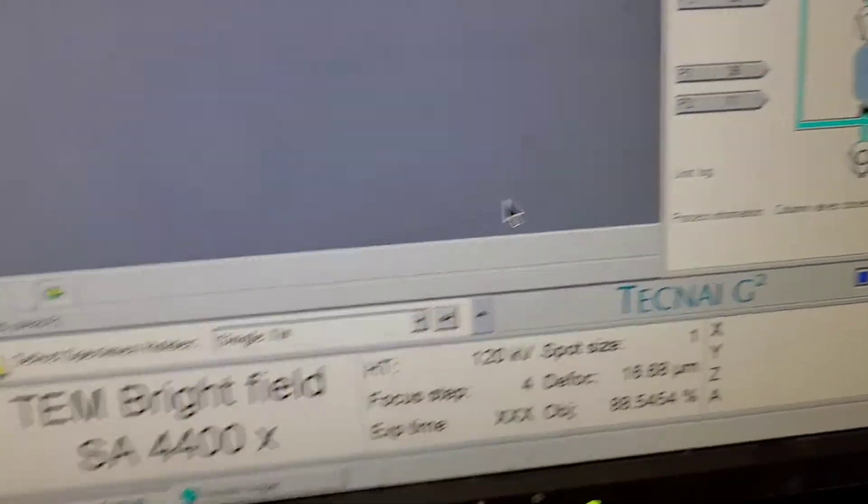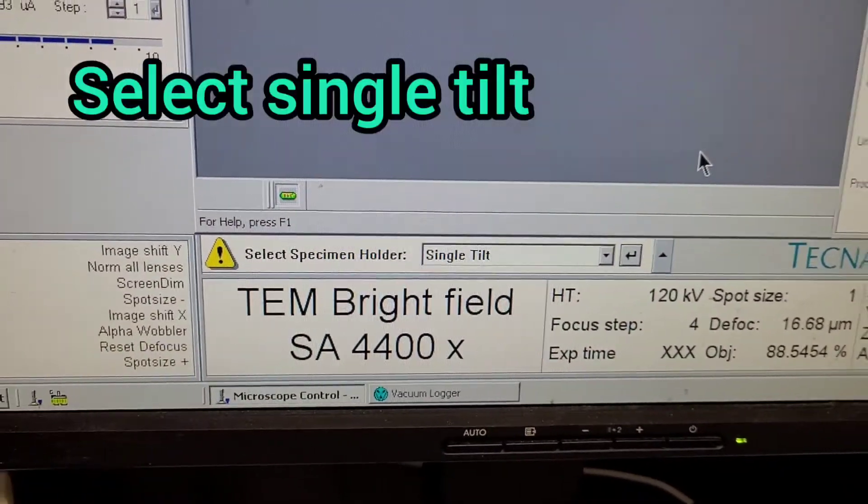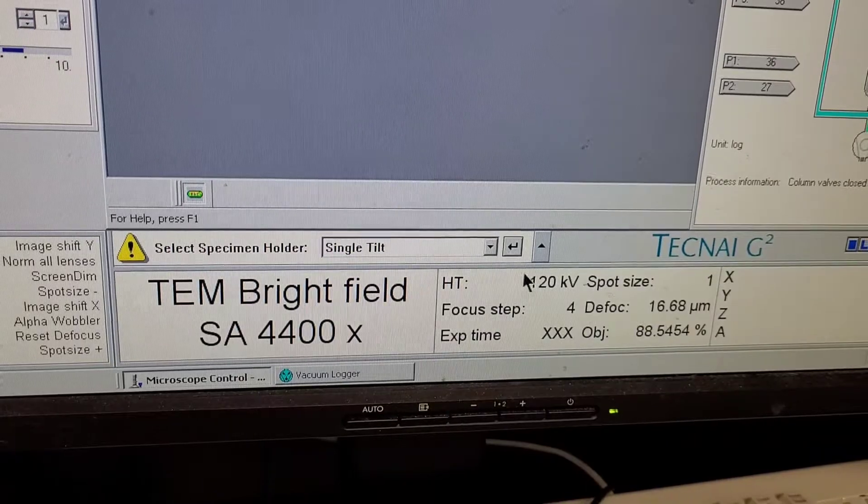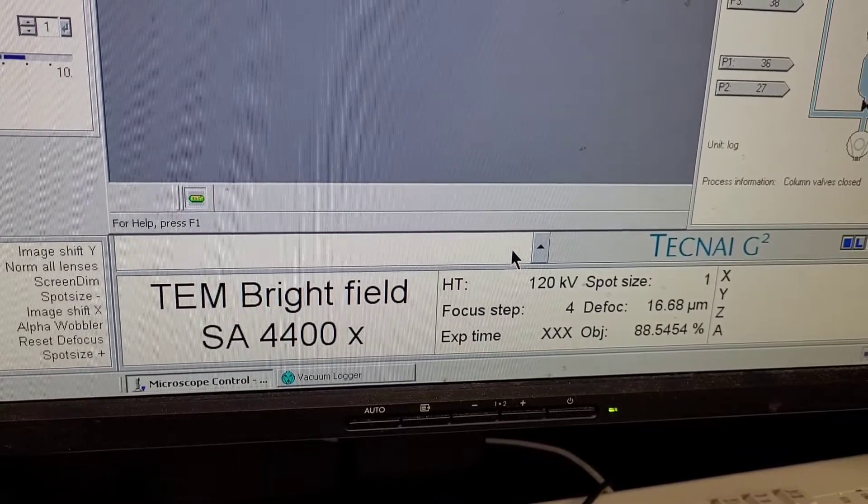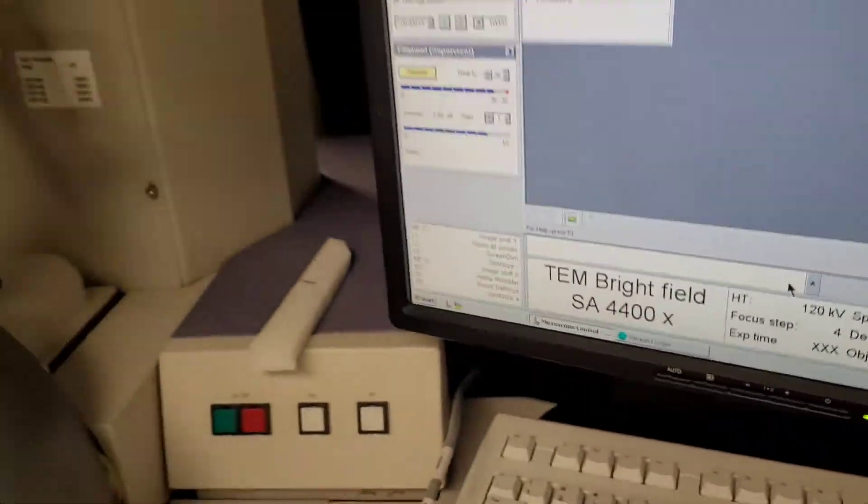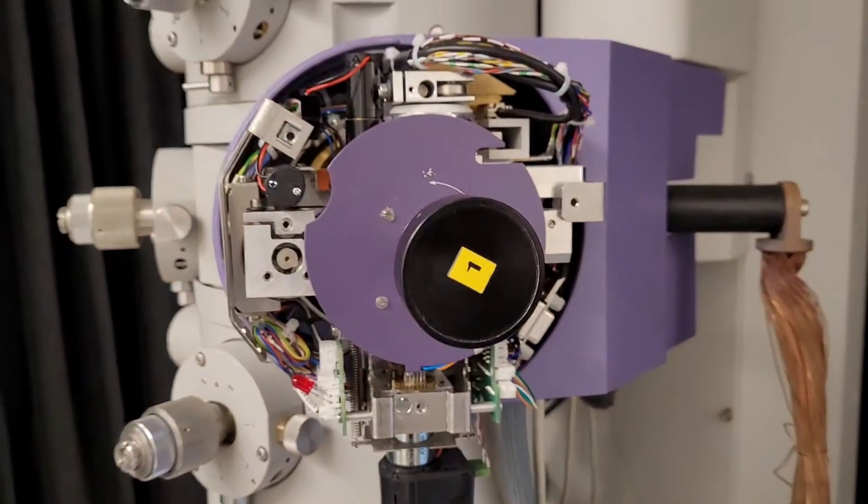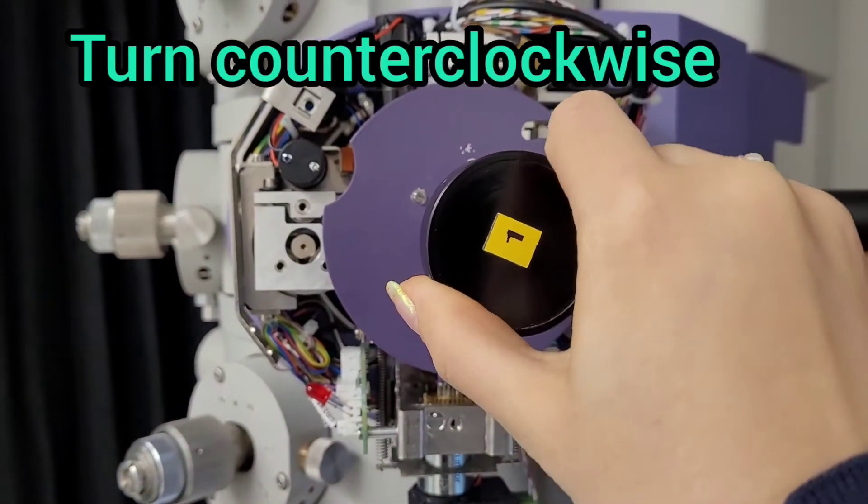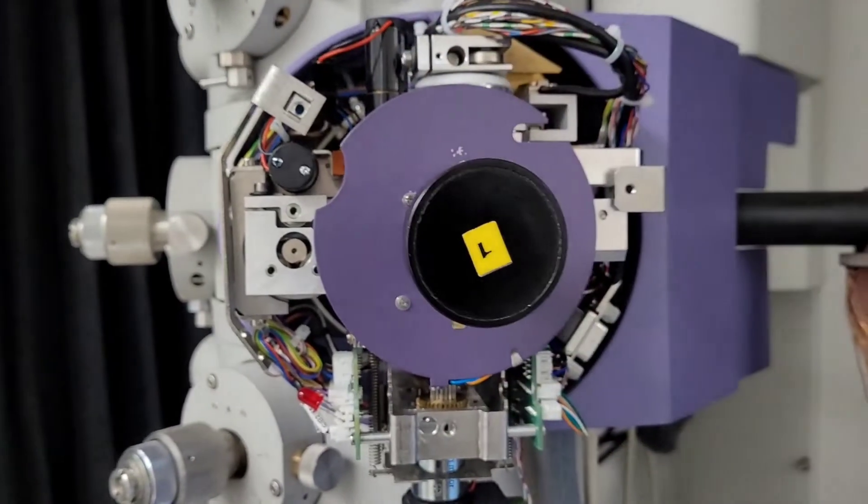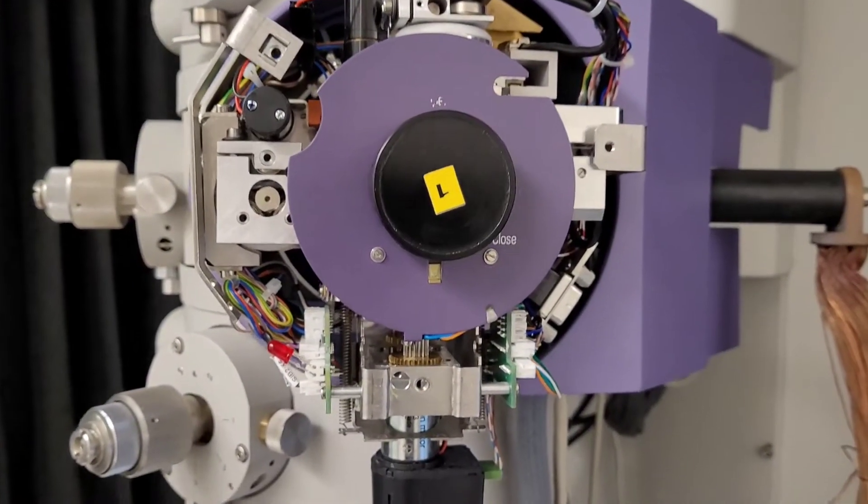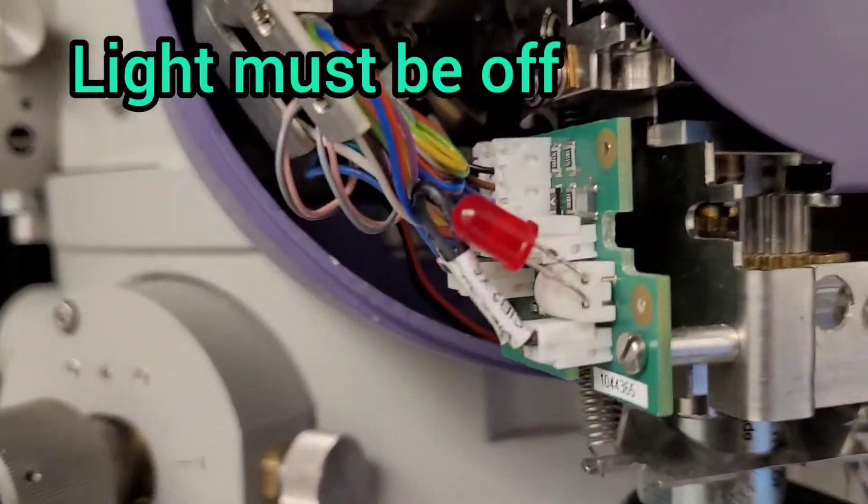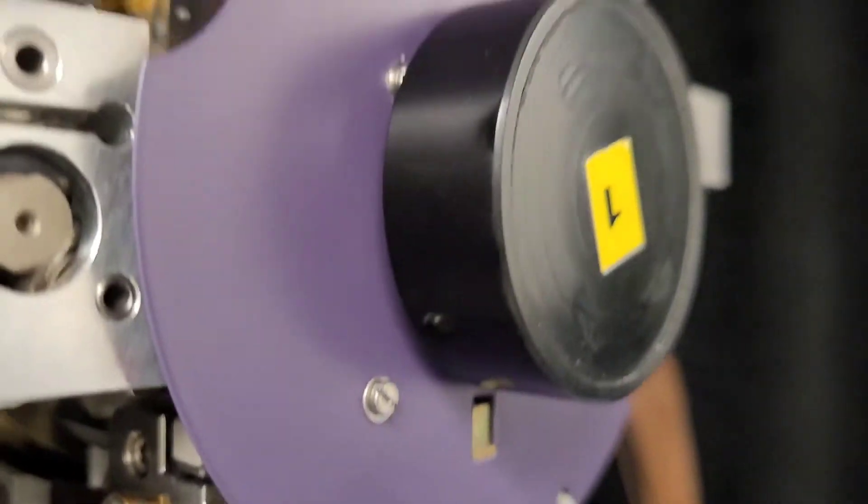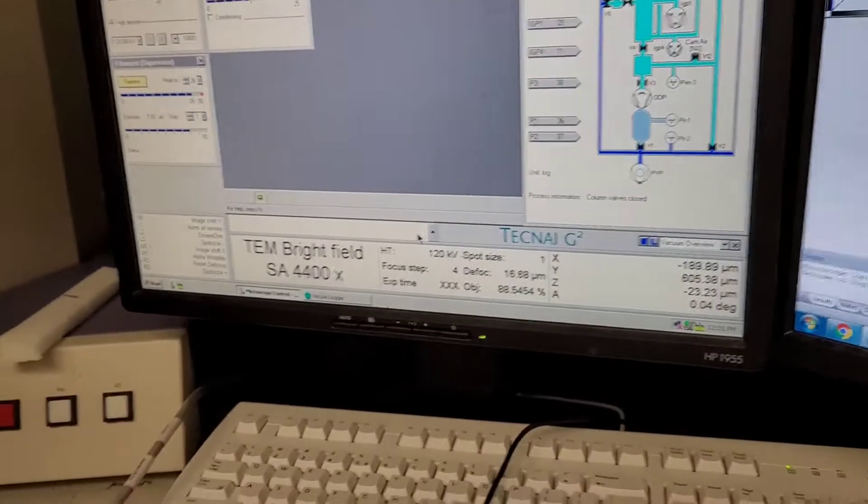You select single tilt as the holder, and then after that you rotate it counterclockwise. It will automatically suck the sample in. Just make sure this red light is off and there are no gaps there, and it's completely sealed.